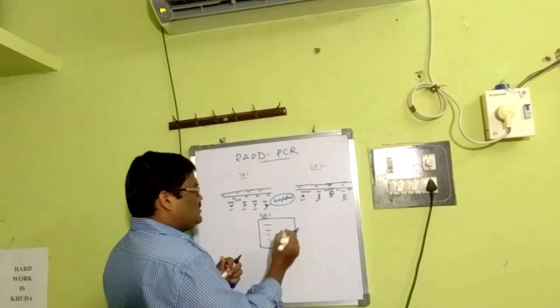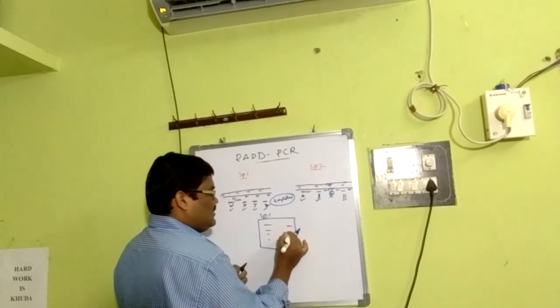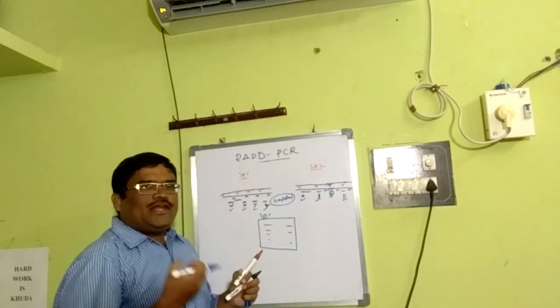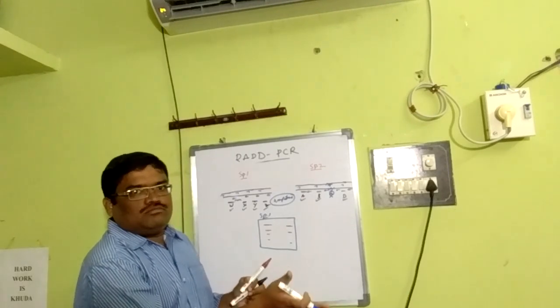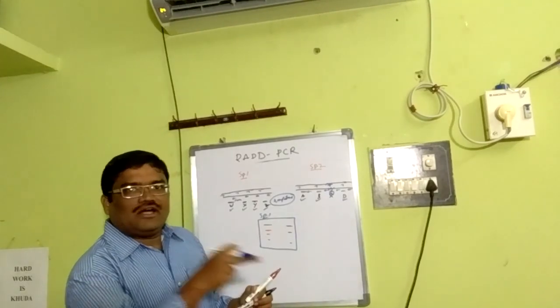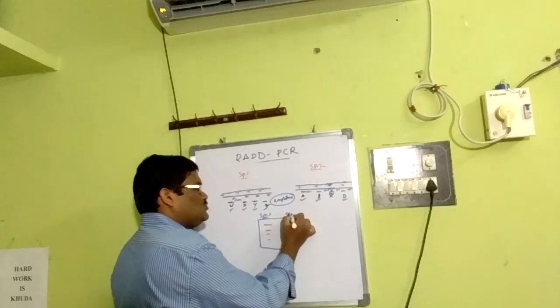With respect to species 2, you know, this is A, this is B, there is no C. So here the gradation depends on the density. The lighter the density, the farther they move. Since DNA is a negatively charged molecule, it moves towards the positive. But if they are lighter, they move faster, they move further. The same is happening. For the understanding, I draw it like that. Okay, this is for species 2.